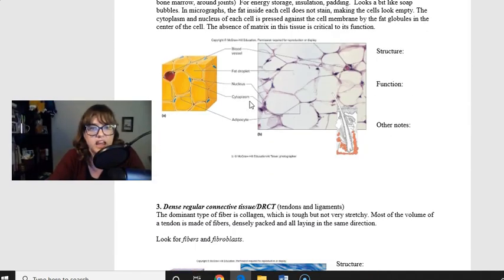As opposed to the adipose tissue, where the fat droplet in it can get so big that it pushes everything else in the cell to the sides. So instead of it being in the center, like in squamous cells, they're pushed all the way to the side. Now, this is how things like diabetes can happen. These cells can get bigger and bigger and bigger. If you are gaining weight, it's not because you're gaining more fat cells. It's that you're loading up your fat cells with more fat droplets. As those cells get bigger, the receptors on their surfaces, which get activated by insulin, get further and further apart, so it's harder for insulin to make them work, and then you can get type 2 diabetes.